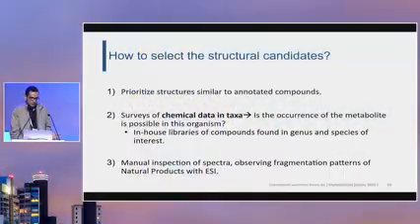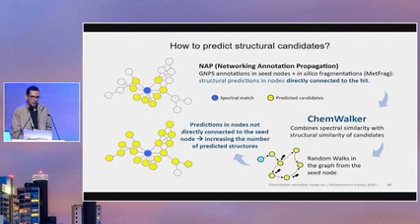First, I confirmed the annotation, and identified if the structure was protonated or with sodium, potassium, and then I selected the candidates that are possibly connected to the hit node.